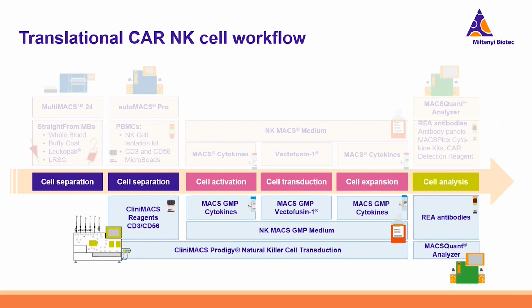For example, the use of feeder cells. This could be difficult in the future. Or right now, you're using the NK cell isolation kit instead of the reagents that are needed to really separate in clinical grade, like CD3 and CD56 microbeads. So just keep that in mind.